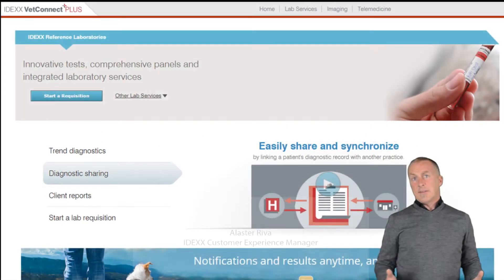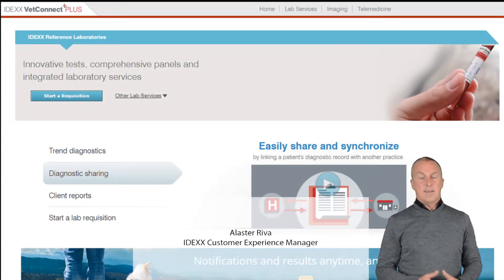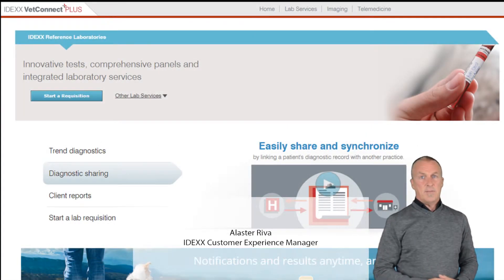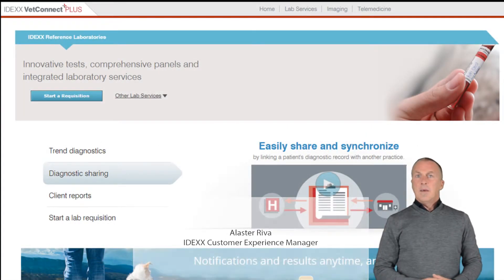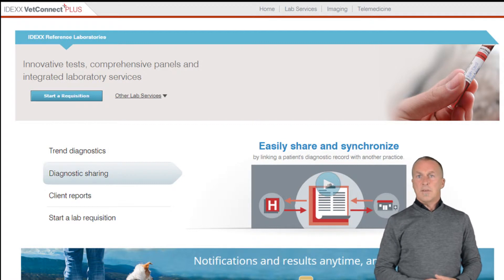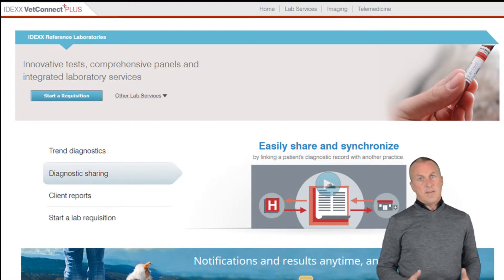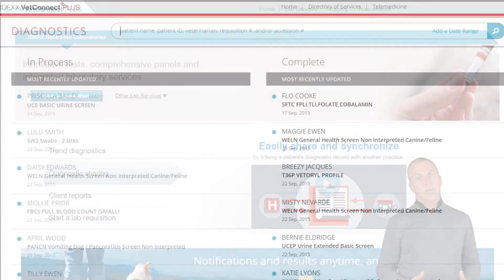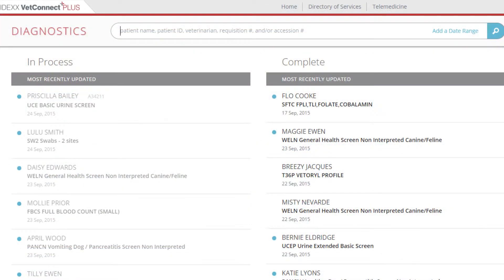Welcome to ordering diagnostic tests using IDEXX VetConnect Plus. In the next few minutes you'll learn how to use VetConnect Plus to search for and order diagnostic tests from IDEXX Reference Laboratories.